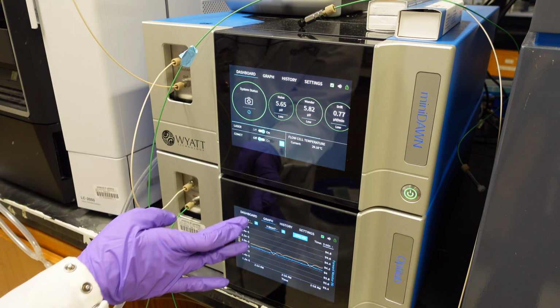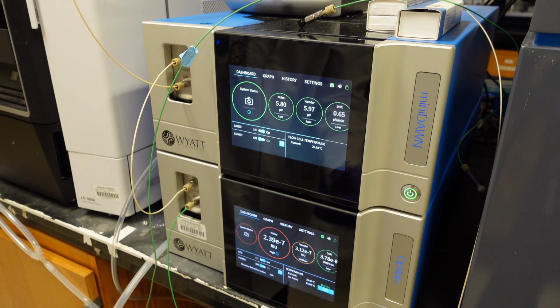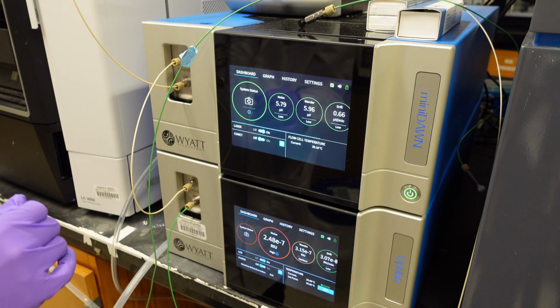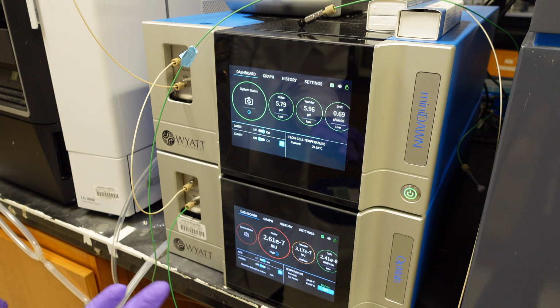Also, if we go back to the dashboard, the fact that these are all green means this one's all ready to go. This one, some of them are red and orange. Usually you'd want to wait till they're all at least orange, so that's okay to run. Ideally, of course, all green.